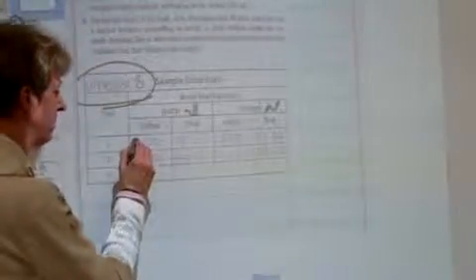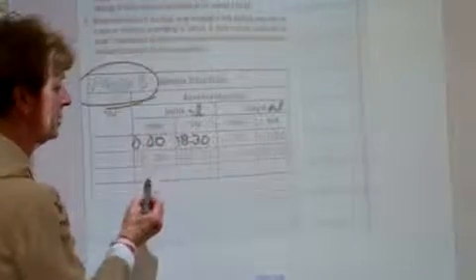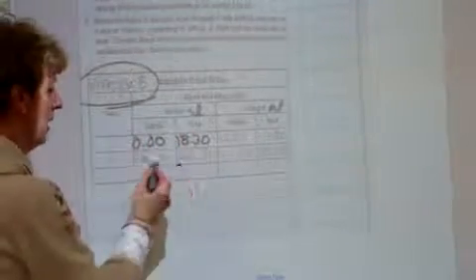All right, so I'm not sure you can read the numbers. I'll try again here. The initial burette reading was 0.00. Don't forget to have a label here, milliliters. Our final volume in the base burette, this is the NaOH, was 18.30.